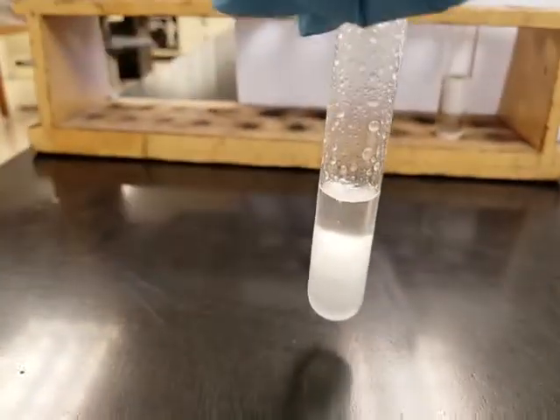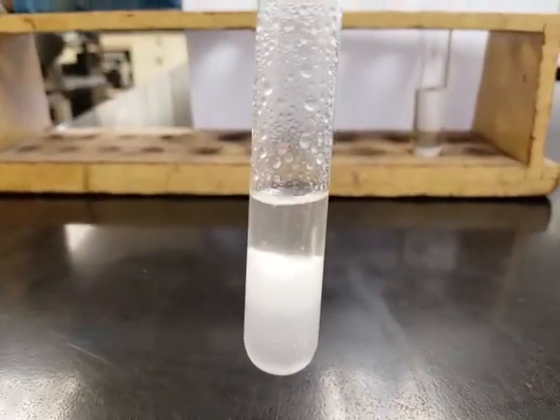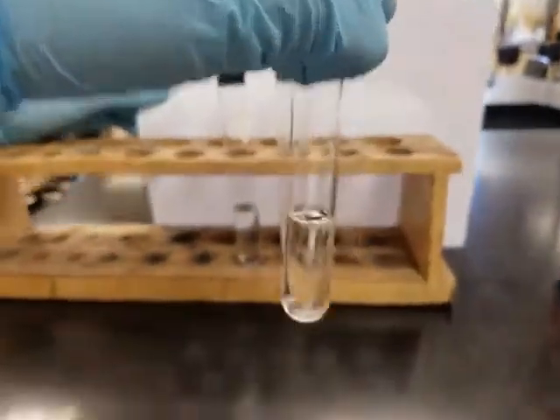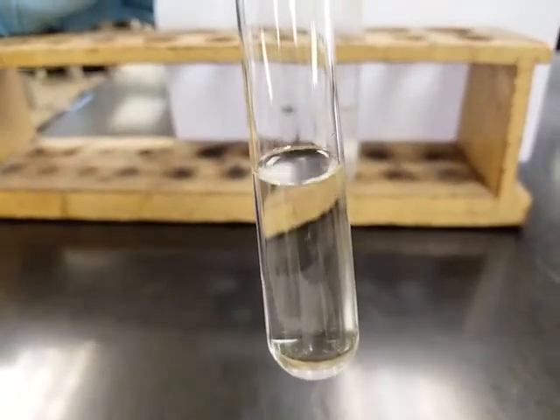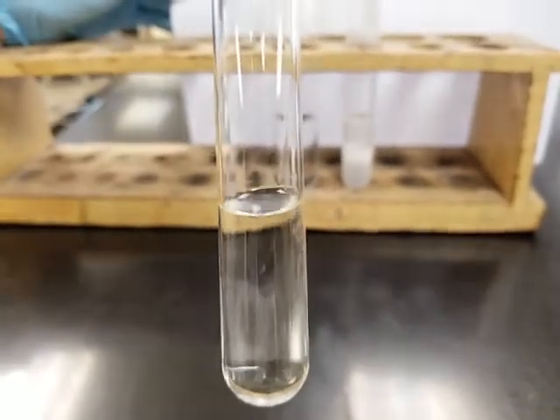You decide. That's number 2. Number 3, isopropyl alcohol and kerosene. Do you see separation of layers, or do you see one homogeneous liquid? Again, you decide.